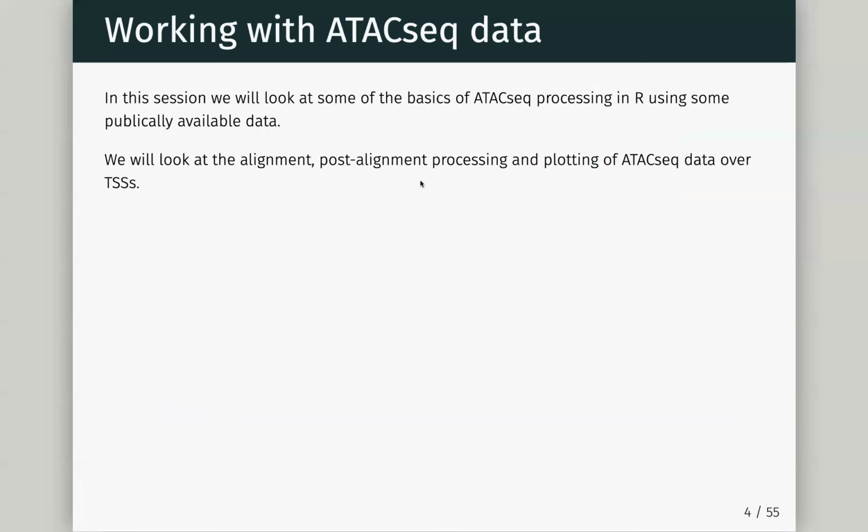So we're going to cover the basics today, ATAC-seq basics, and we're going to look a little bit post-alignment too at some quality control we can get from some simple tools. I actually think we're going to plot this at the beginning of our next session.